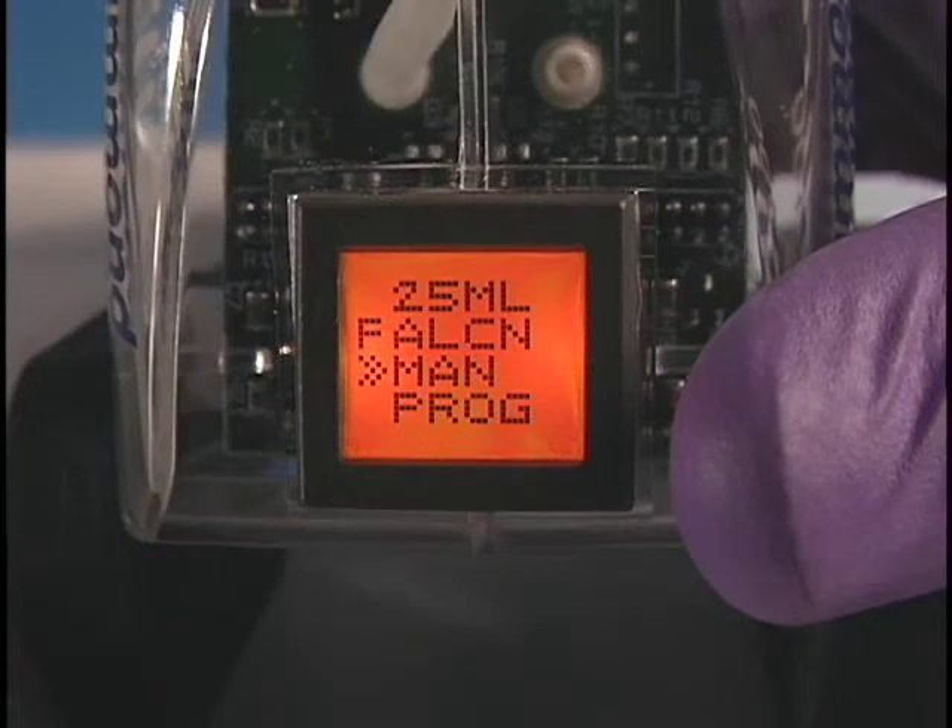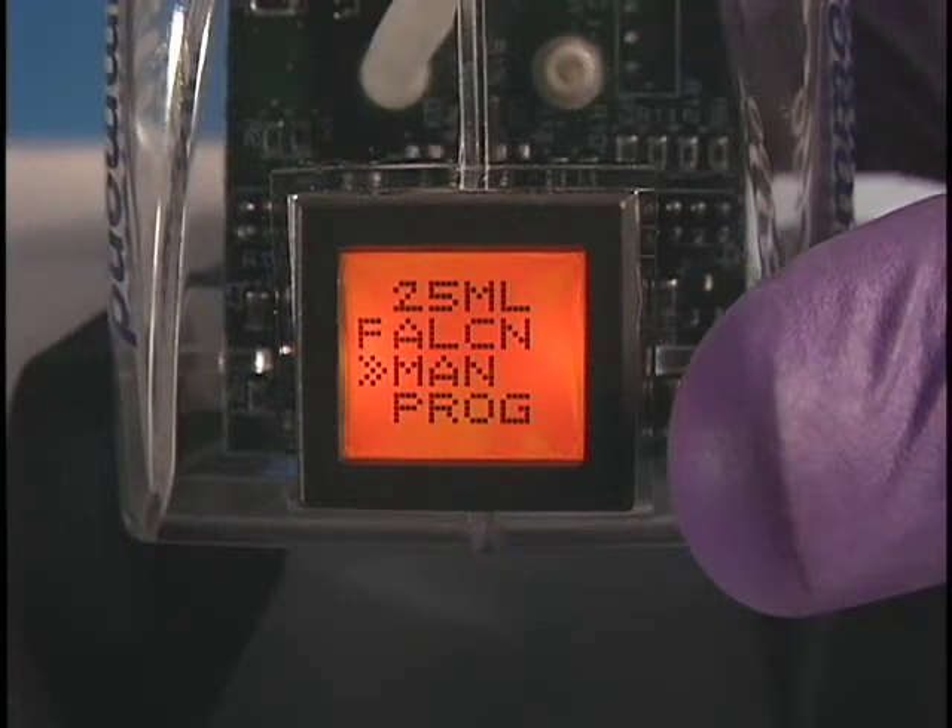To use the Elite in the automatic mode, enter the size and type of pipette being used.